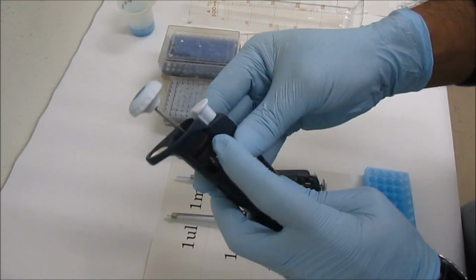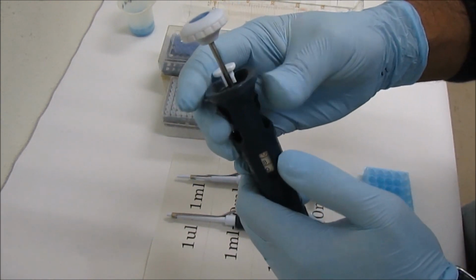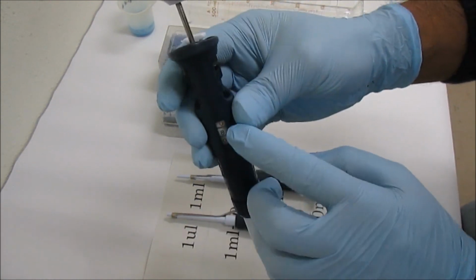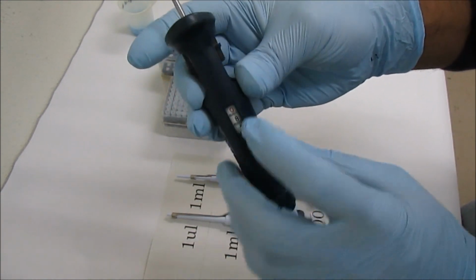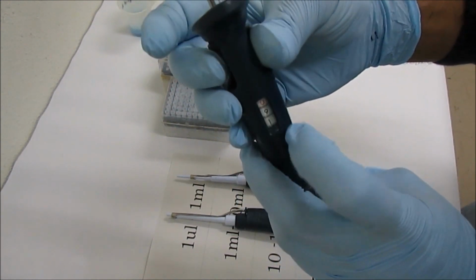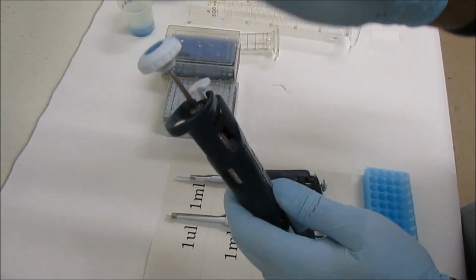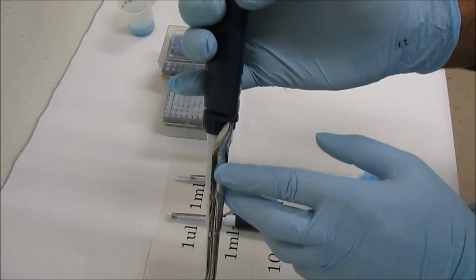This is the adjustable knob, black in color, where you set the volume that you need. Here you can see digits. When you move it clockwise or anti-clockwise, you see the measurements change, so you can set the volume by looking at the display. So this is the body, the plunger, the display, and the adjustable knob.